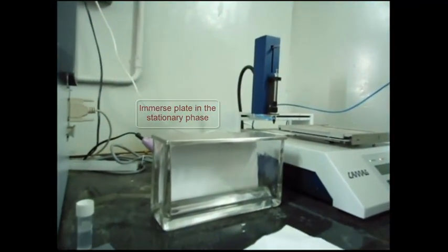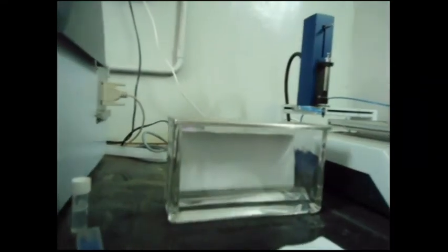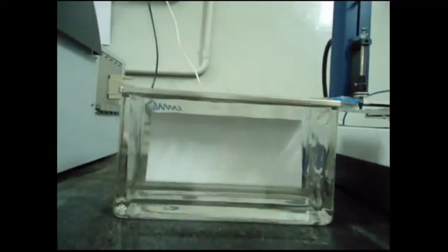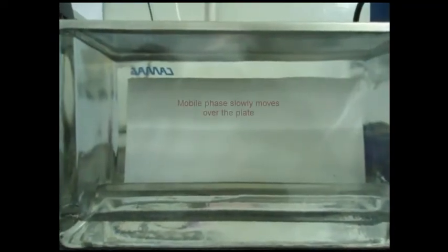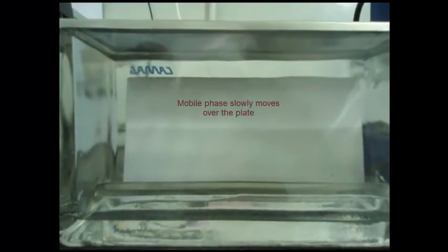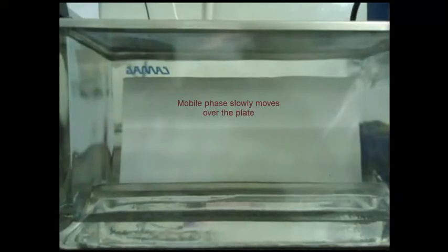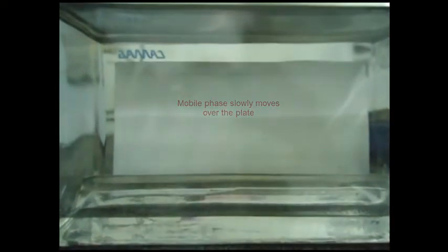Mark 8 cm from the bottom on the chromatographic plate. Then immerse the chromatographic plate inside the twin chamber and allow the mobile phase to move over the plate. Never allow the mobile phase to move over the marked position.